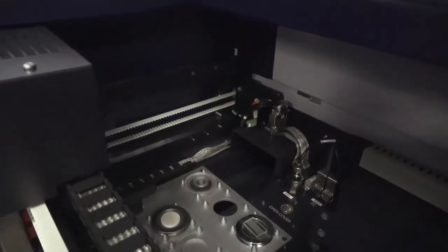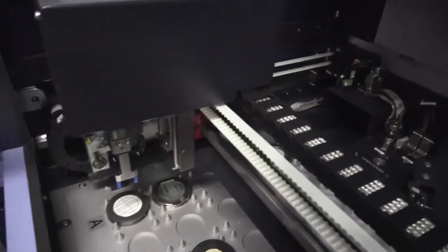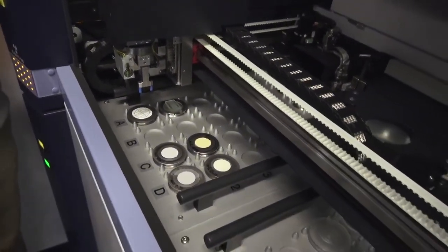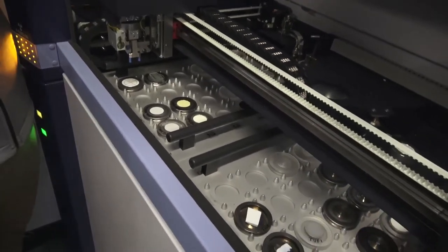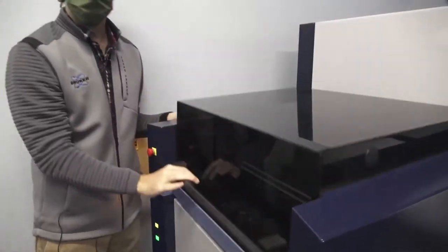Okay. Now, in terms of sample holders, are these kind of the standard ones that everybody uses? Yeah, they sure are. These are the same holders that we use on the Advance, but they're also industry standard size, 51.5 millimeters.